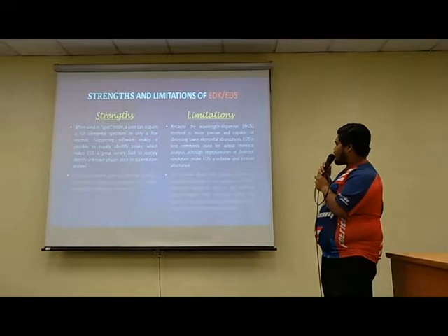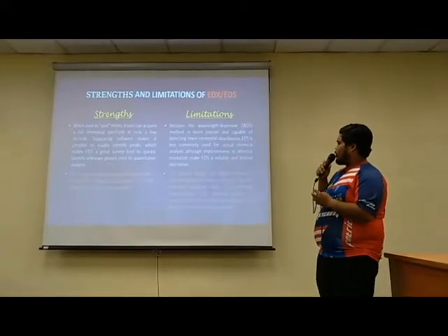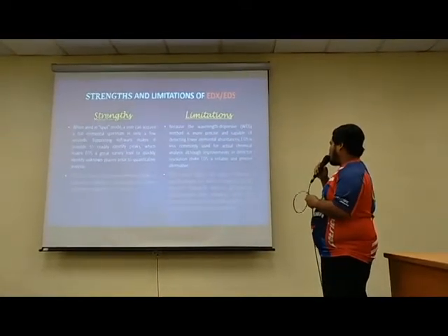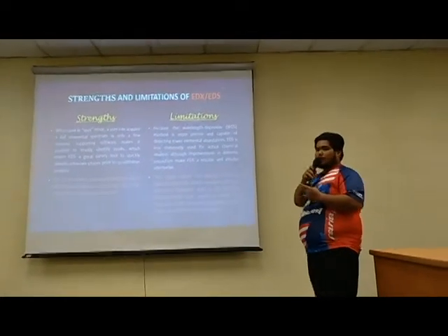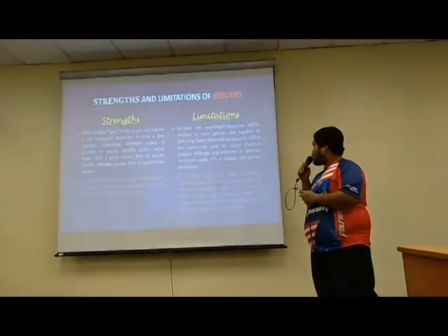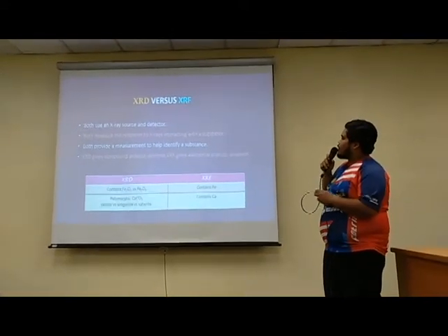EDS cannot detect the lightest elements, typically below the atomic number of sodium, because of the detector window. Polymer-based thin windows allow for detection of light elements depending on the instrument and also the operating conditions. Then XRD versus XRF.